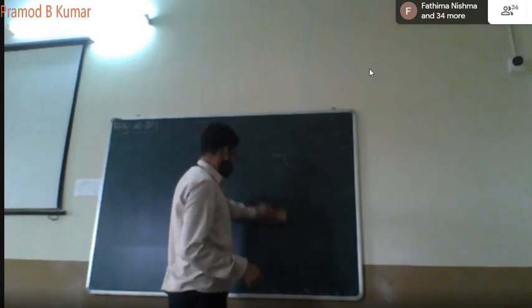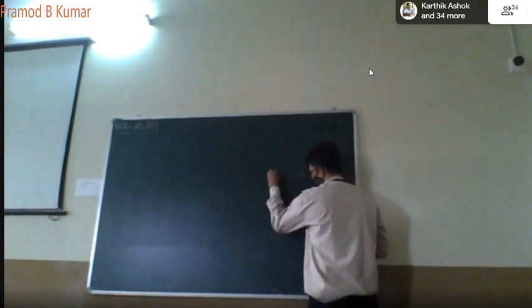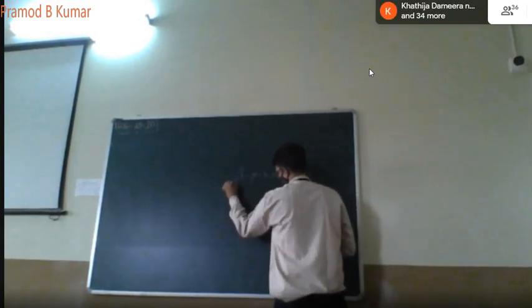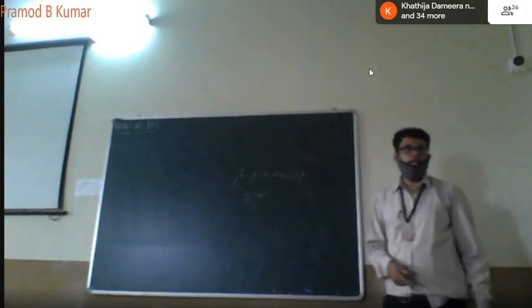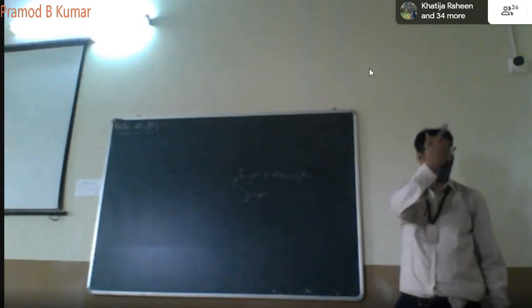You have got your records in front of you. Please refer to your record. Okay? Please see your record. Look at your record. So what is the first step? You have sodium acetate. You treat it with acetic anhydride. Sodium acetate is a base. It will abstract the proton from your acetic anhydride to form a nucleophile.